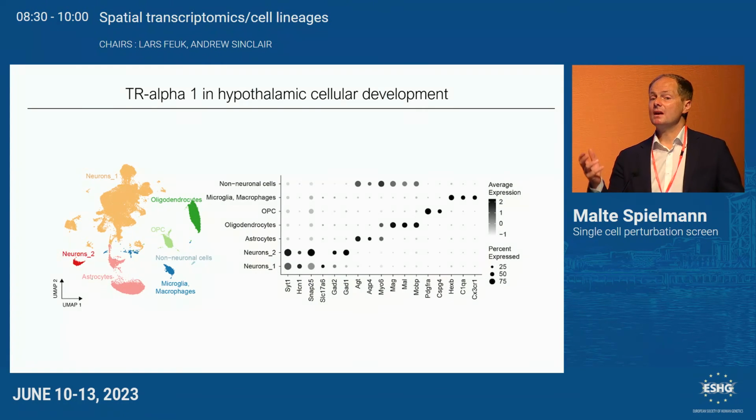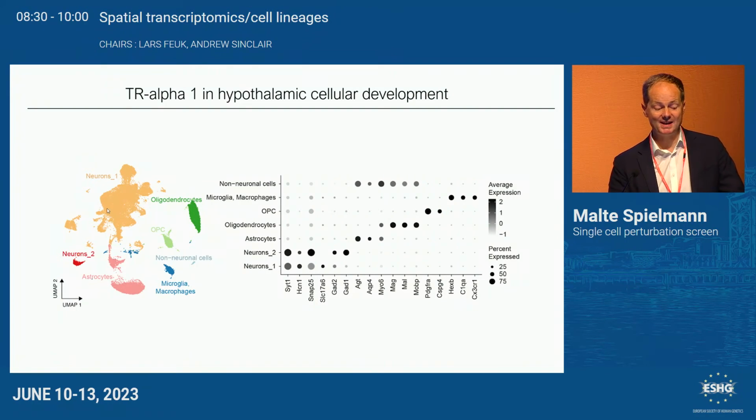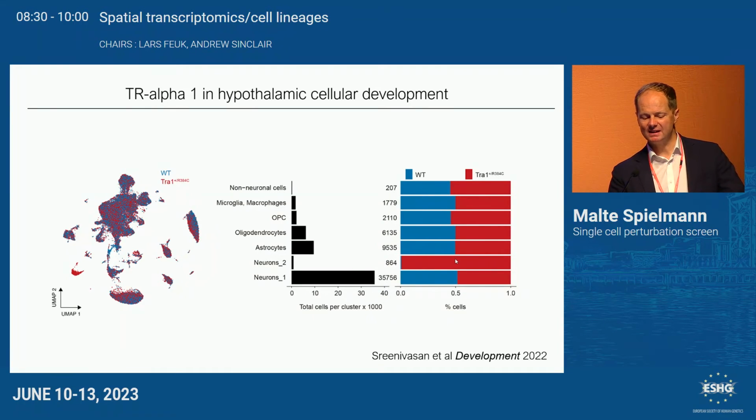But now, Jens told us, I know this mutant. Just look for my favorite cell type and don't care about the rest, right? The phenotype has to be in the neurons because they have intellectual disability. So Varun did his magic and looked in the neurons, but there wasn't much different really. So these are actually the major cell types, sorry. And we saw that there were no big differences except here, which was actually an artifact. So you can see this is just from one replicate. But there wasn't really a massive decrease of neurons.